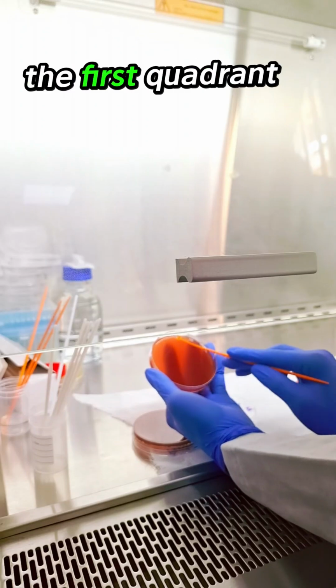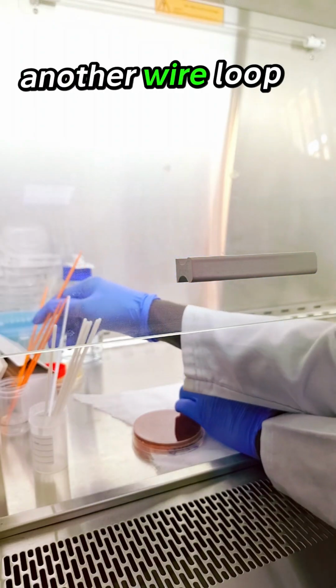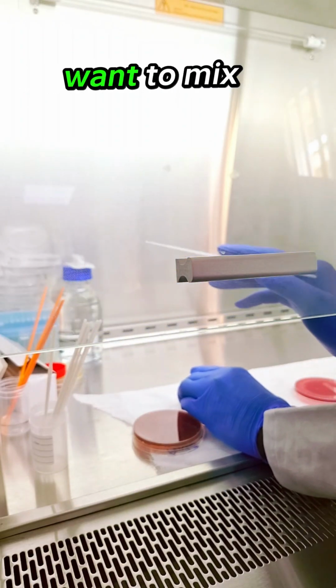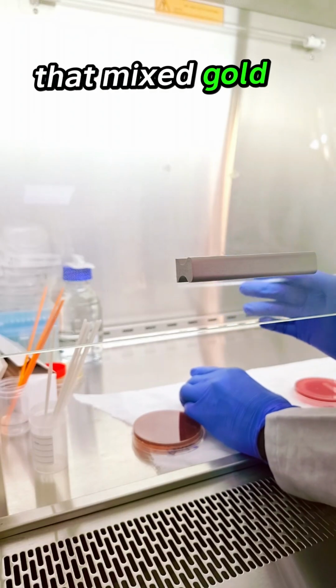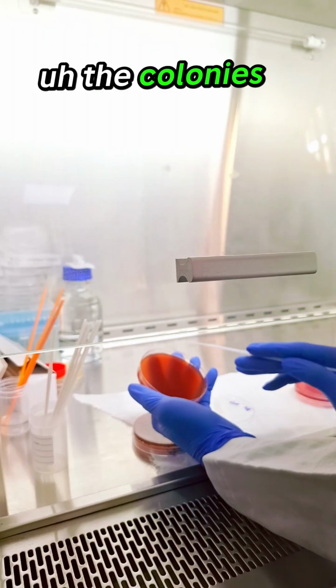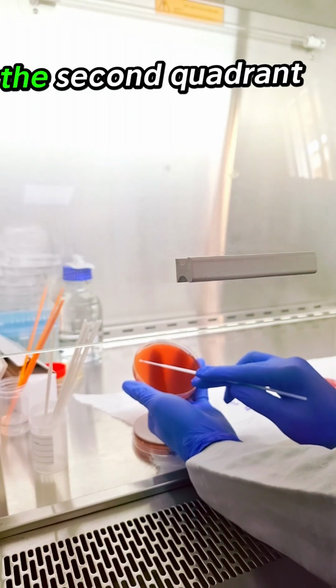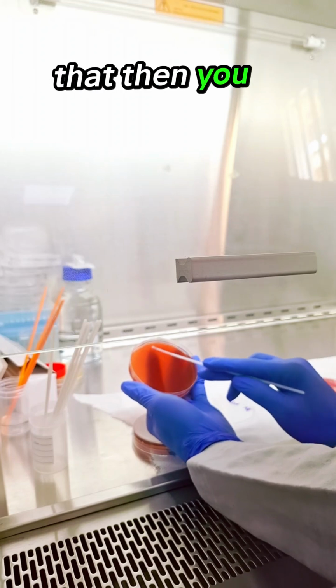So this is the first quadrant. I'm using another wire loop because we don't want to obtain that mixed growth. We want to at least separate the colonies, so we are going to use another loop here. So I'm going to make the second quadrant. That's like this, making a straight line like that. Then you streak.